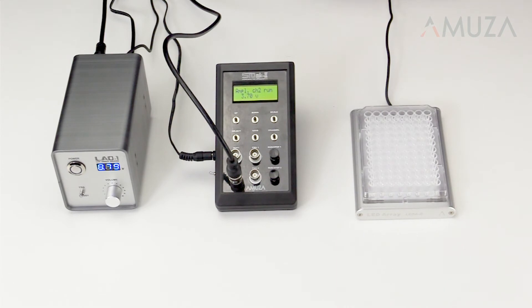Our pulse generator is easy to program and use, but if you already have your own pulse generator or stimulator, you should be able to use it with Teleopto.